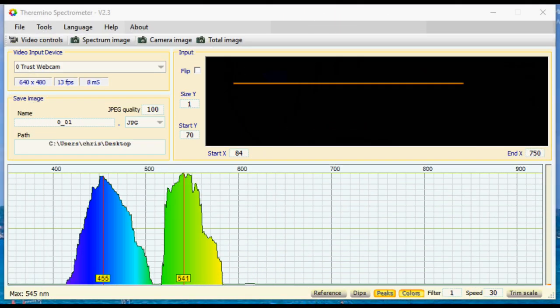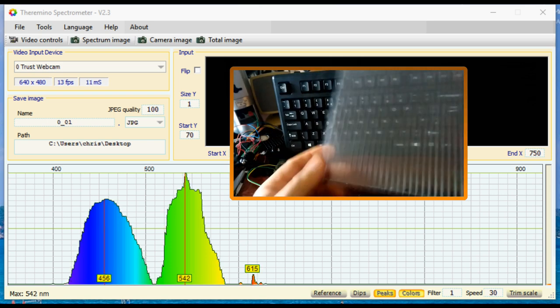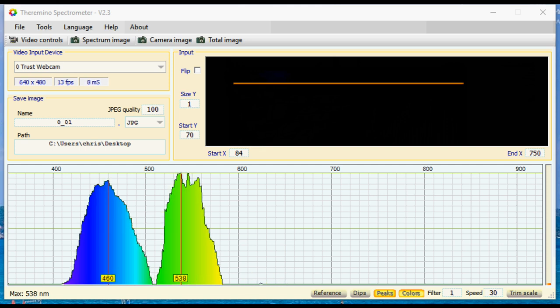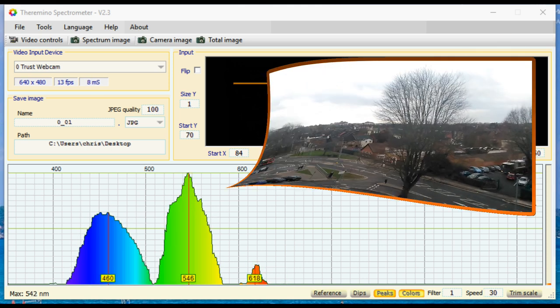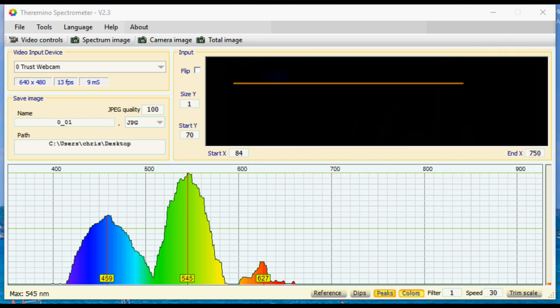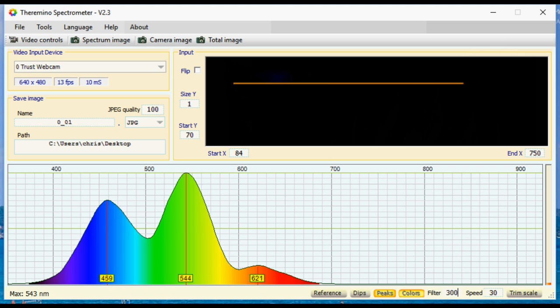I want to see if the chlorotherm laminated polycarbonate construction material I've got for a possible greenhouse is going to significantly impact the spectrum of light coming from the sky. So today it's very dull and overcast and windy and miserable, and so the first thing I'm going to do is try and take out this statistical noise here by putting, let's say, 300 in there. This is averaging 300 samples, which is why the curves are bouncing around less and the jagged edges have gone. It's an averaging process, so it's less responsive, more of an overall picture.